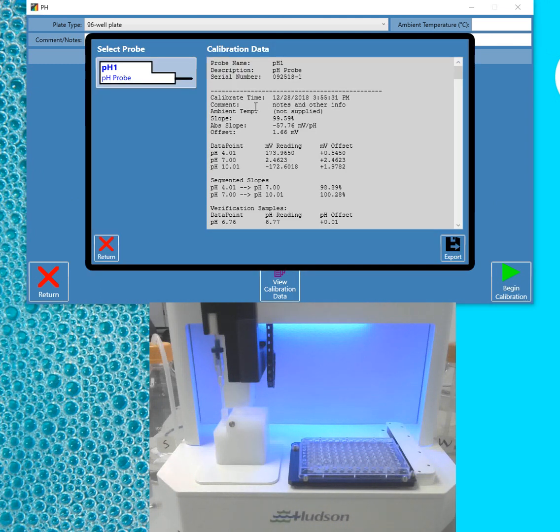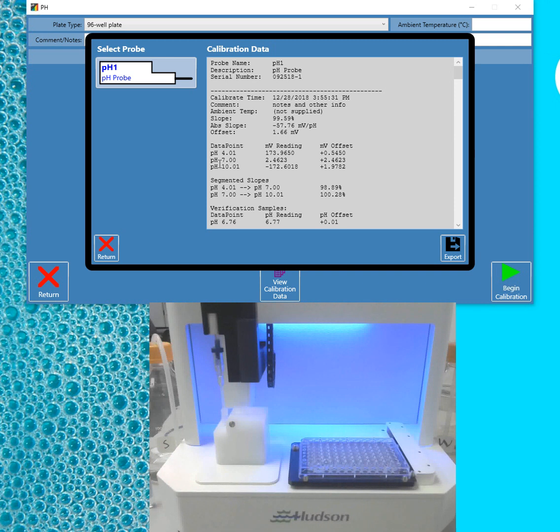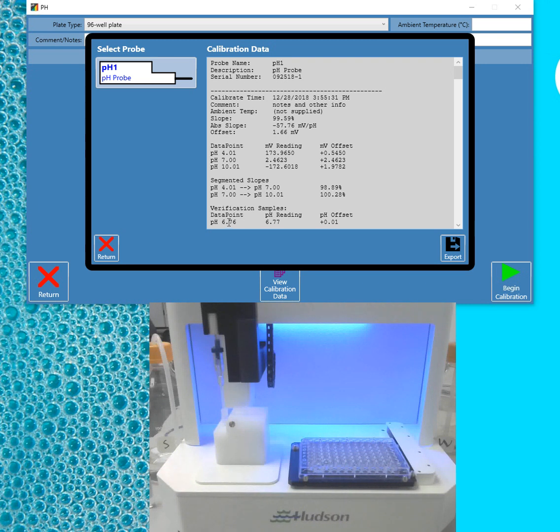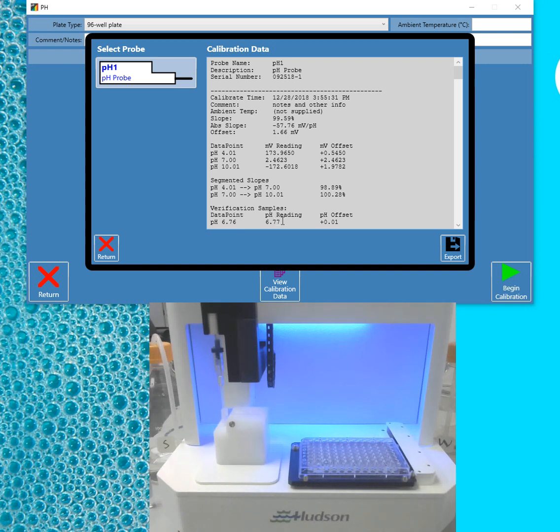So here you can see the information, including the note that I just typed in for the comment. You can see your data points. You can see the millivolt readings and the offsets for each point. Then you see your segmented slope from 4 to 7, then 7 to 10. And then you can see the verification sample, which was a 6.76, and our reading was a 6.77.